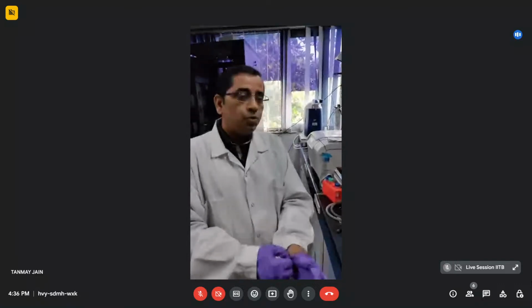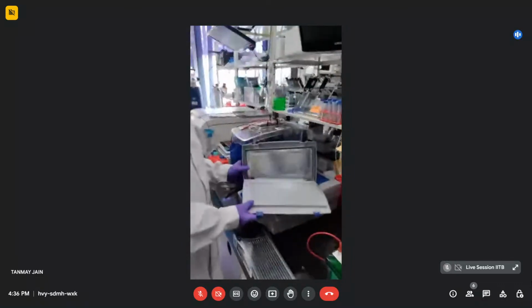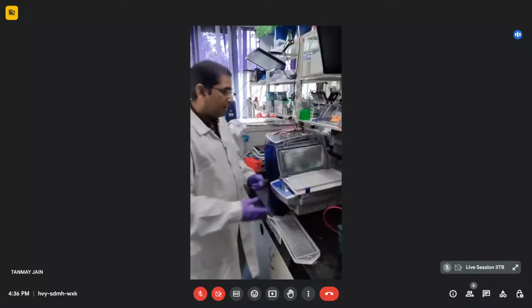It's always important that you know how well you can separate your complex mixture. So that's where having the larger IPG strip can be more useful, and these kinds of trays give you the ability to look into separation on up to 24 centimeter long strips. But the strip could be of various lengths, right?